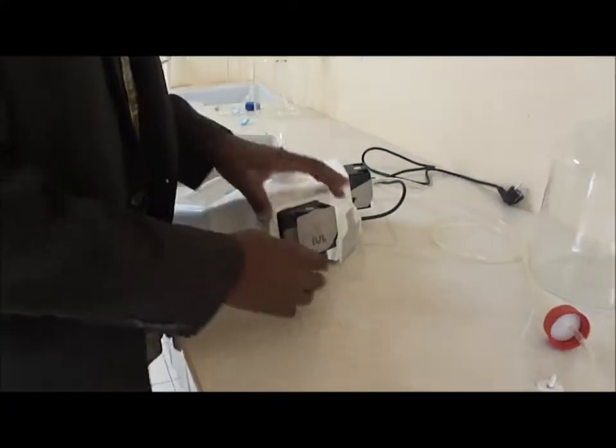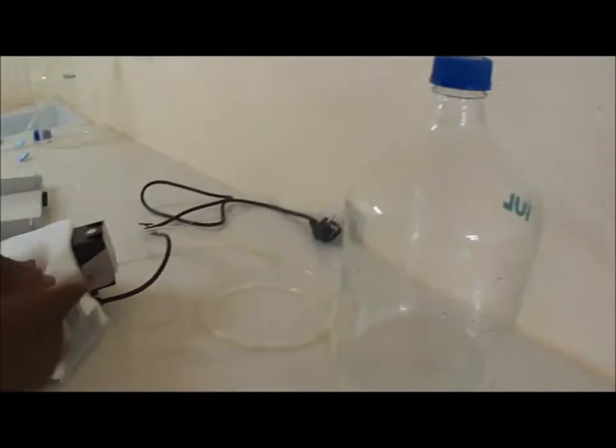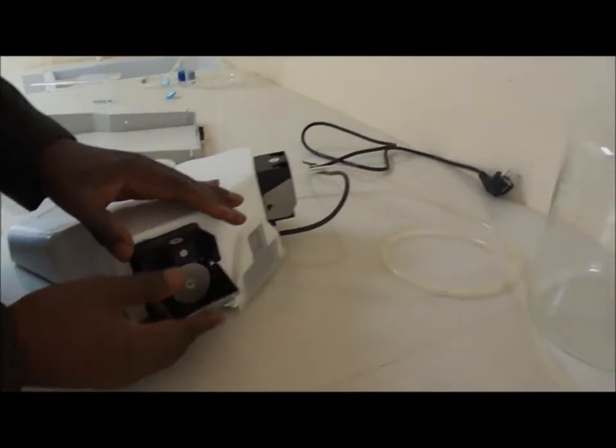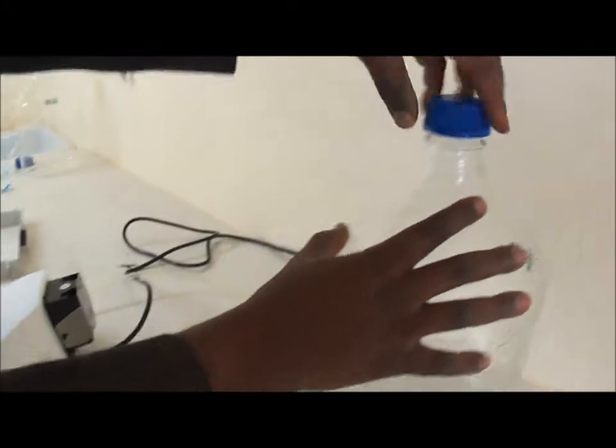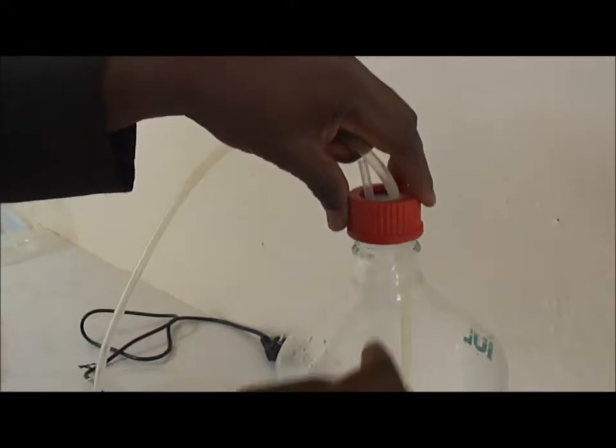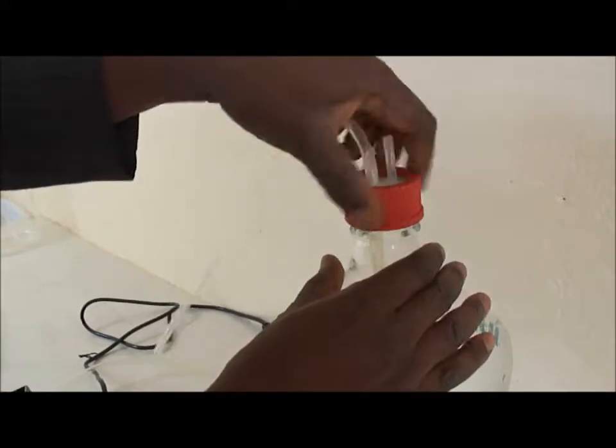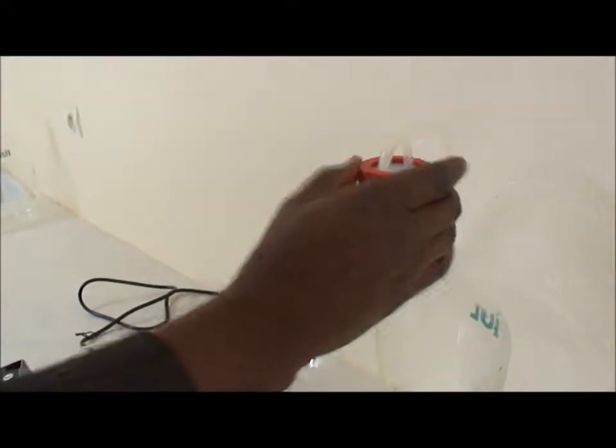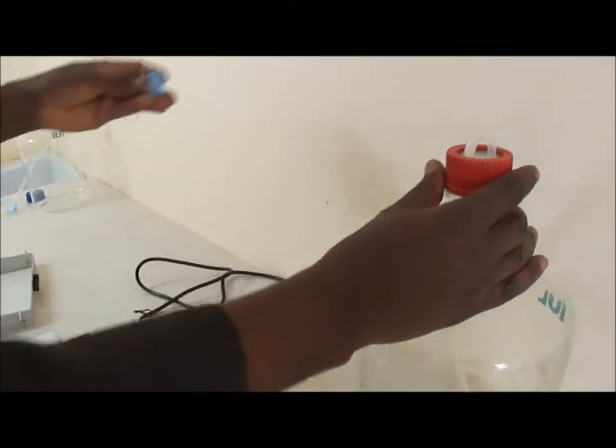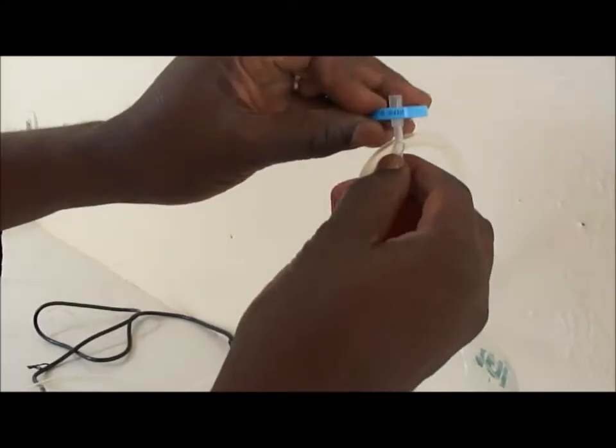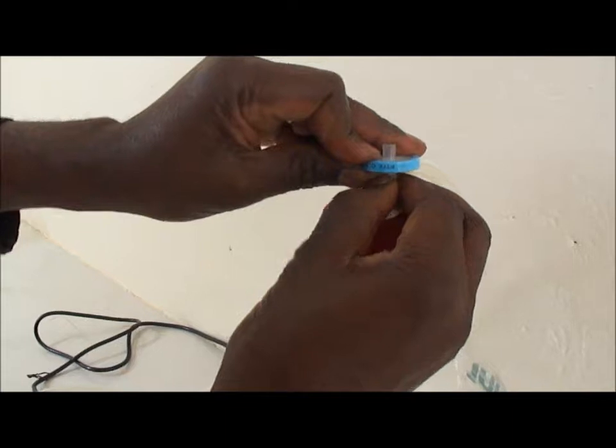Now we will show how to mount the bottle, one of the bottles to the first pump. You first remove the plug, the blue plug, and then you insert the red plug and screw it firmly. You mount one of the air filters on the top here, and that's it.